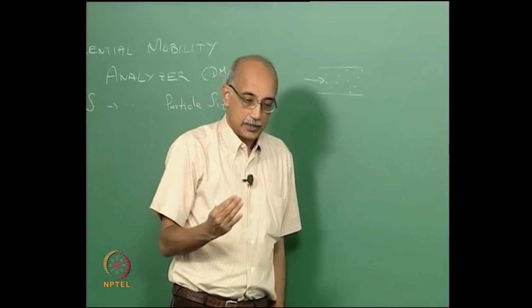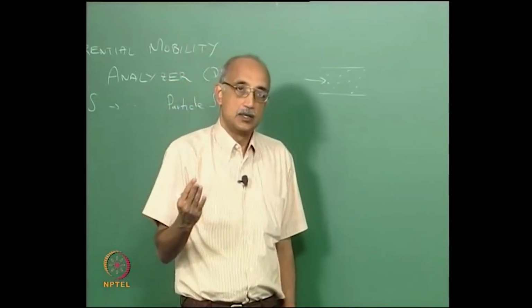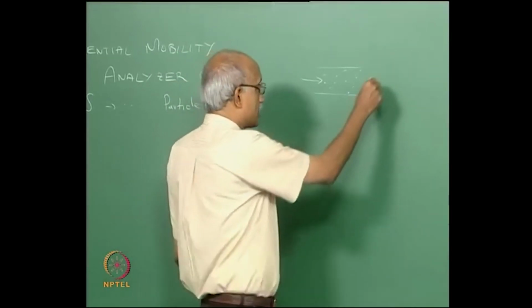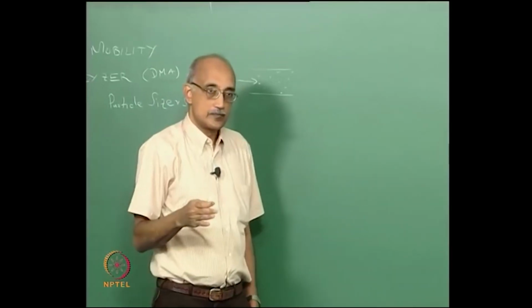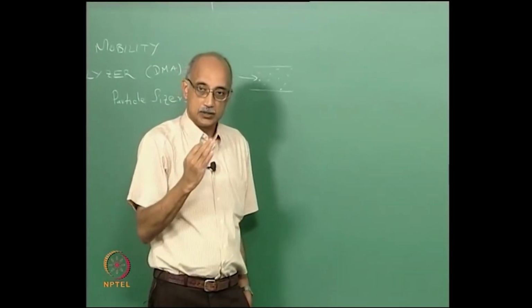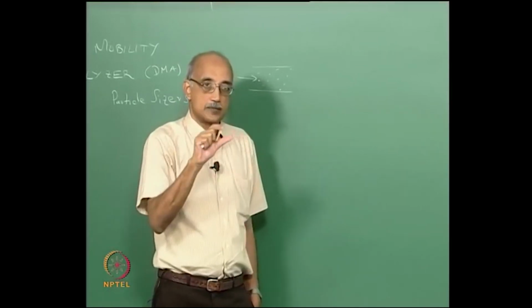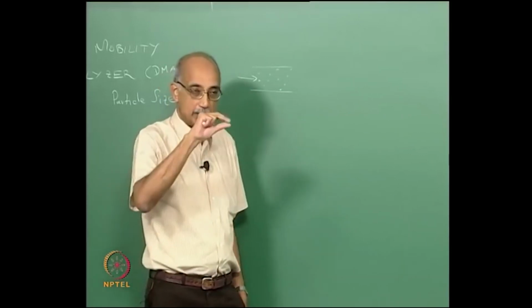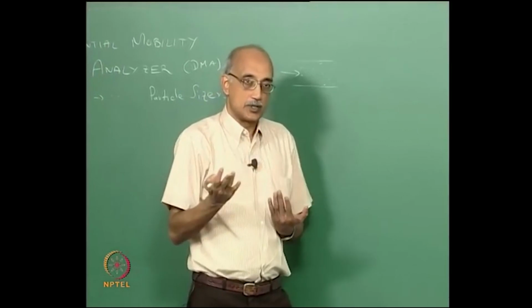In a cascade impactor, you take advantage of the fact that larger particles have greater kinetic energy. So, again, if you use a set of screens, the largest particles will most likely be captured in the first screen itself, and then the smaller particles will be successively accelerated to greater velocities by narrowing the diameter of the chamber to improve that capture efficiency.